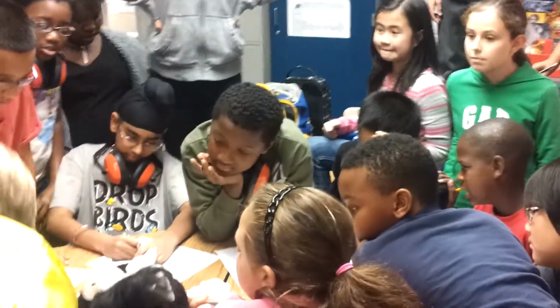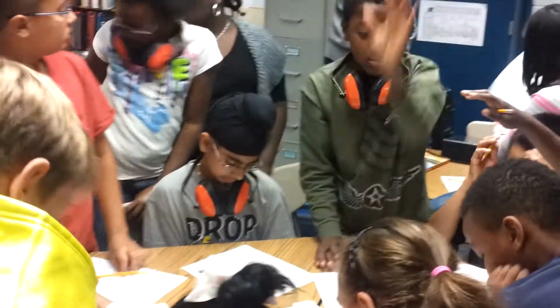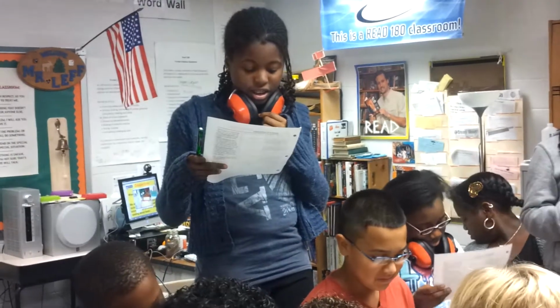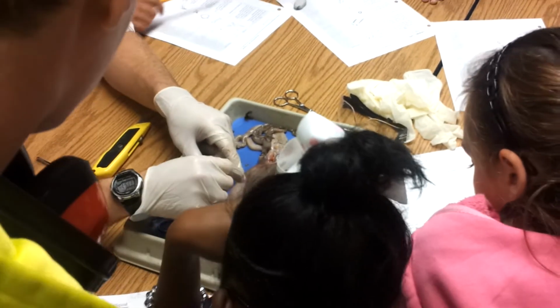Okay. Step number 7. I need someone to read step number 7. Pull out the pen. This is the backbone of the squid. If you cut far up enough, you should be able to see the tip of it poking out. Just grab onto it and pull. If it doesn't break in half, don't worry. It doesn't matter. So I'm going to pull out the pen.